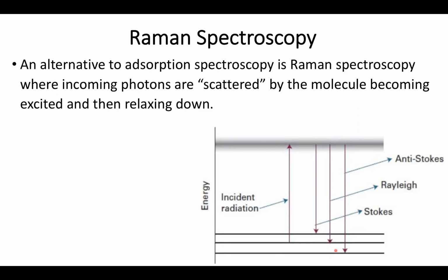One of the things that makes this quite different is that instead of light being absorbed and then emitted, like classic emission spectroscopy, this process is actually fairly quick. Visually, what you tend to see is light almost being scattered outside of the molecule as the new radiation spins off in some new direction. This is further complicated by the fact that the wavelength of light emitted doesn't necessarily have to be the same as the wavelength of light absorbed.